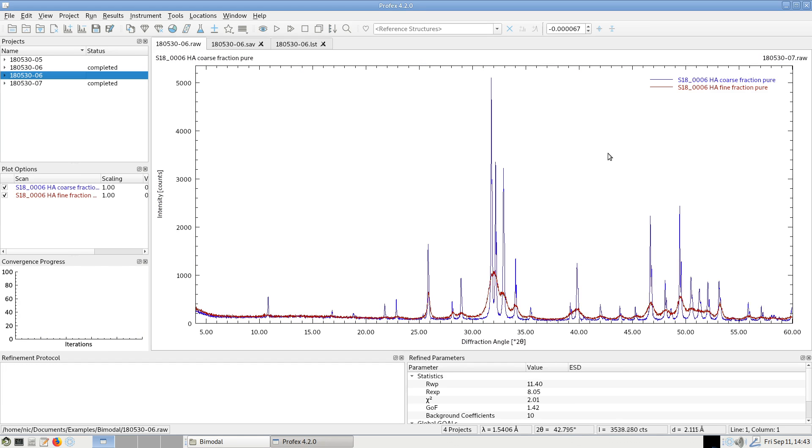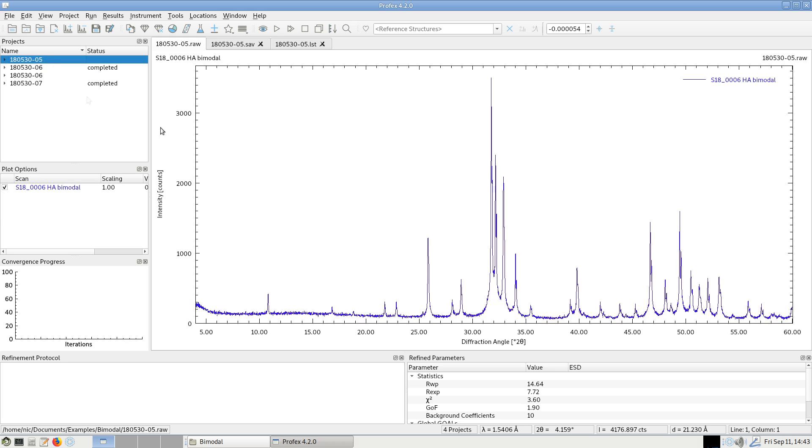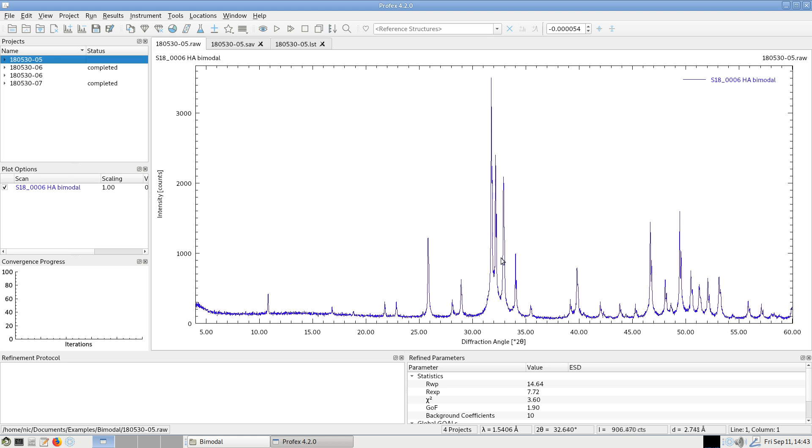But what happens if a nanocrystalline fraction and a highly crystalline fraction of the same phase occur in one sample? So we have a certain fraction of hydroxyapatite with very sharp peaks, but also a second fraction with very broad peaks. In that case we get funny peak shapes like this, like shown here, this is a 50-50 mixture of these two phases. And we can see sharp peaks at the top and very broadened feet.